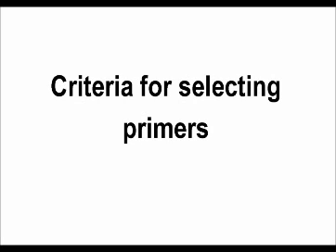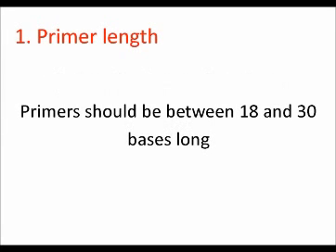We're going to use 6 criteria by which to refine the microsatellite regions that we've got. So let's have a look at them in turn. The first one is the length of the primer. As it says on the screen, the primers should be between 18 and 30 bases in length. When judging any microsatellite for its suitability, one of the first things we need to do is look: is it the right length? We've got 2 primers for each microsatellite, and we count the number of bases in each. If either primer has less than 18 bases or more than 30 bases, we'll eliminate it straight away.